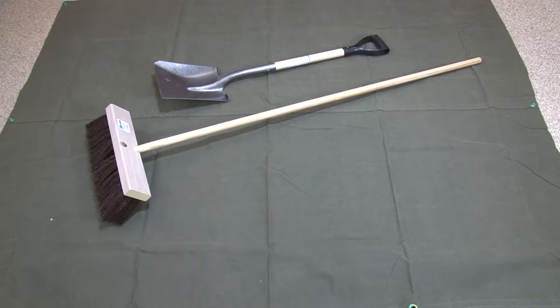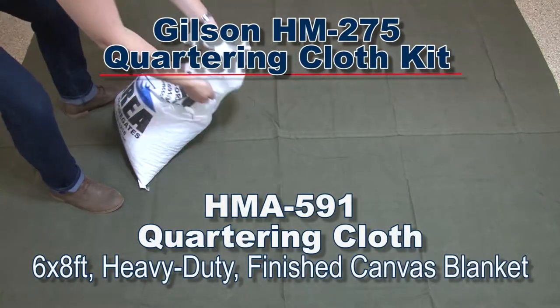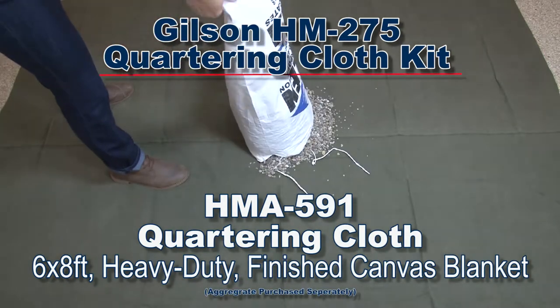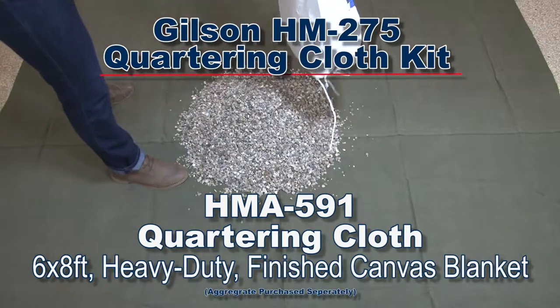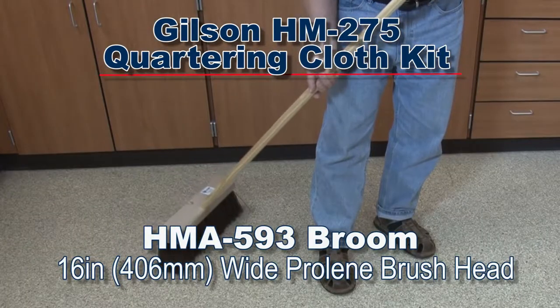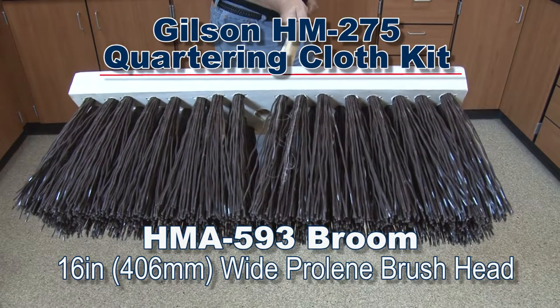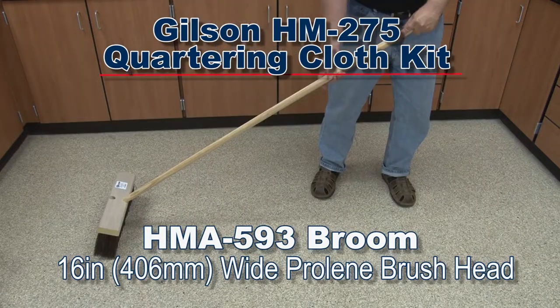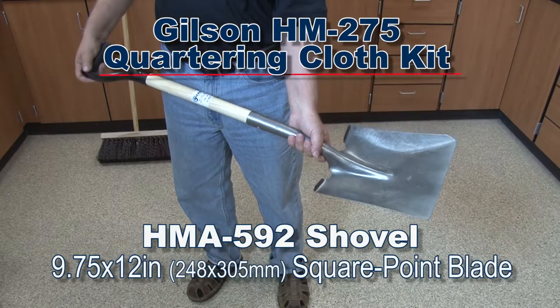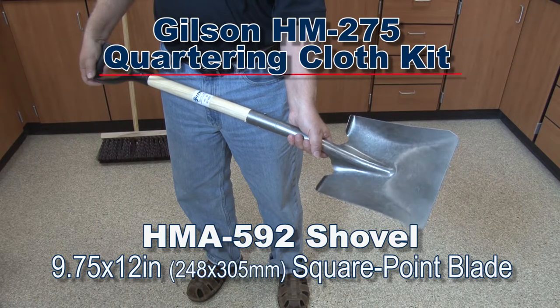Components of the HM275 include the Gilson HMA591 Quartering Cloth, which is a 6x8 heavy-duty finished canvas blanket; the Gilson HMA593 Broom with a 16-inch Prolene plastic brush head and a 4-foot handle; and the Gilson HMA592 Square Point Shovel with a 9.75 x 12-inch blade.